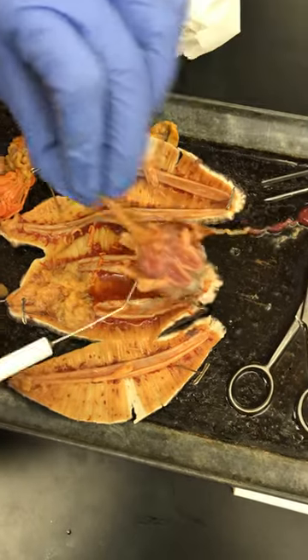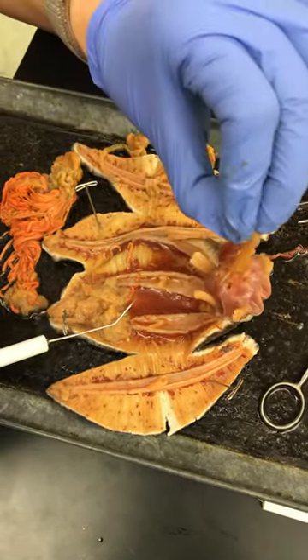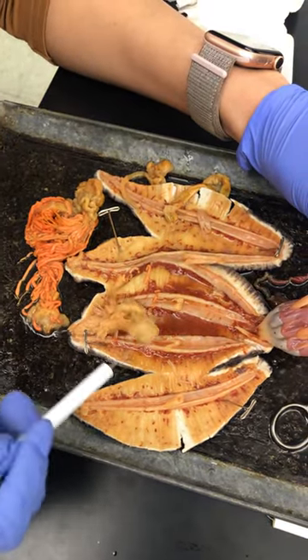There are little holes here. I think this is the ring canal. And then this is the respiratory tree.